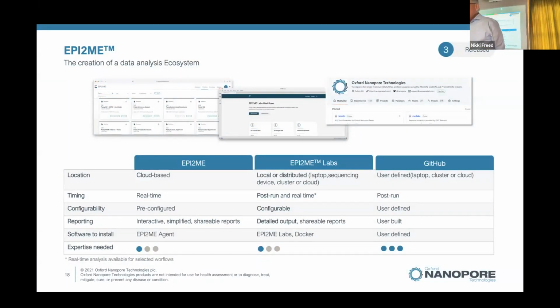Data analysis is challenging. There's a lot of data and it's complex. And how do you do it? What resources do I have available in-house, and what does Nanopore give me? And this is just a nice snapshot of the three general approaches.